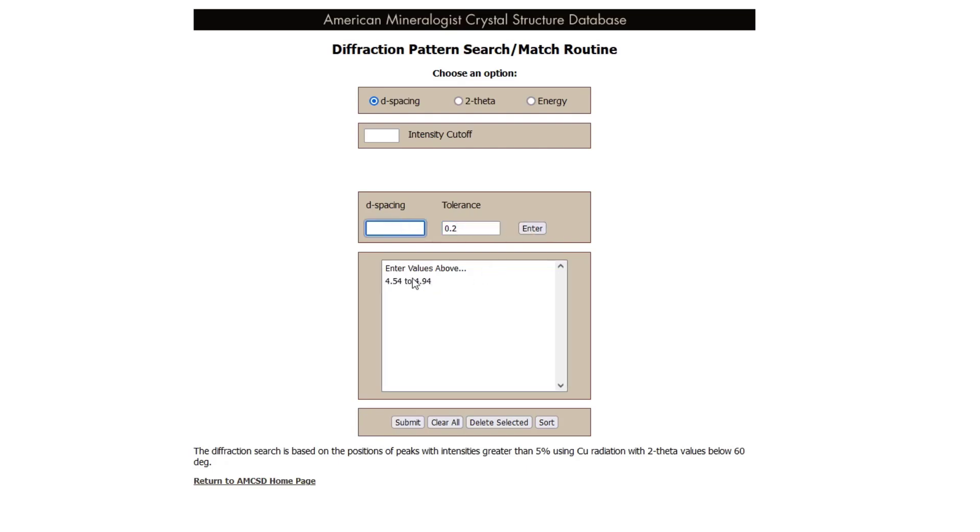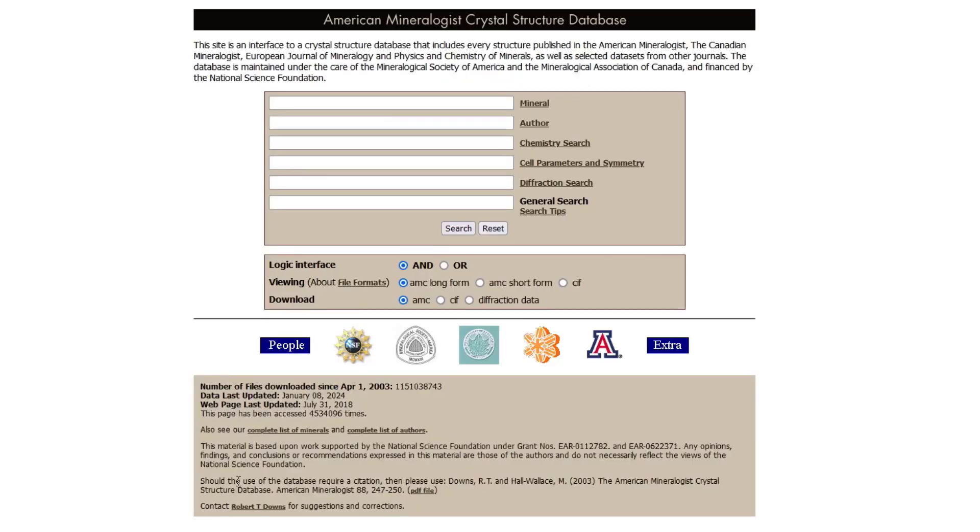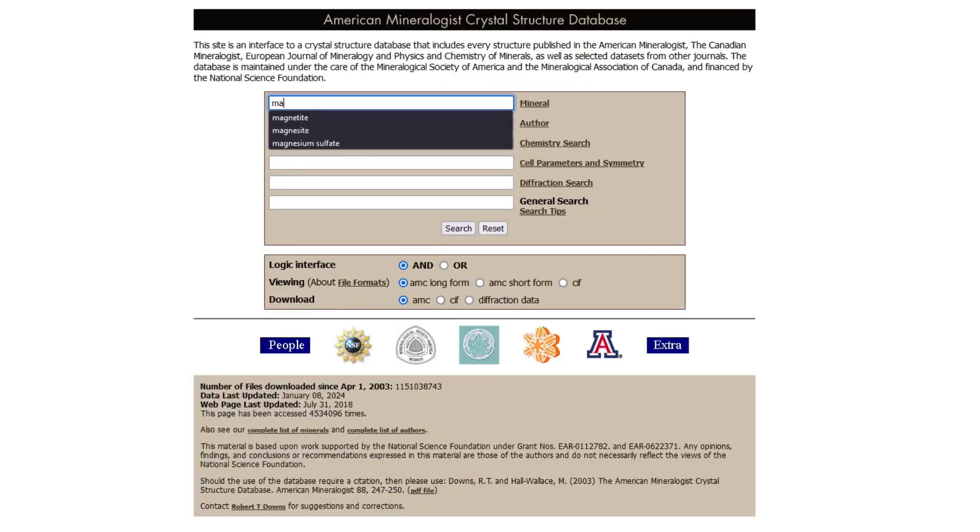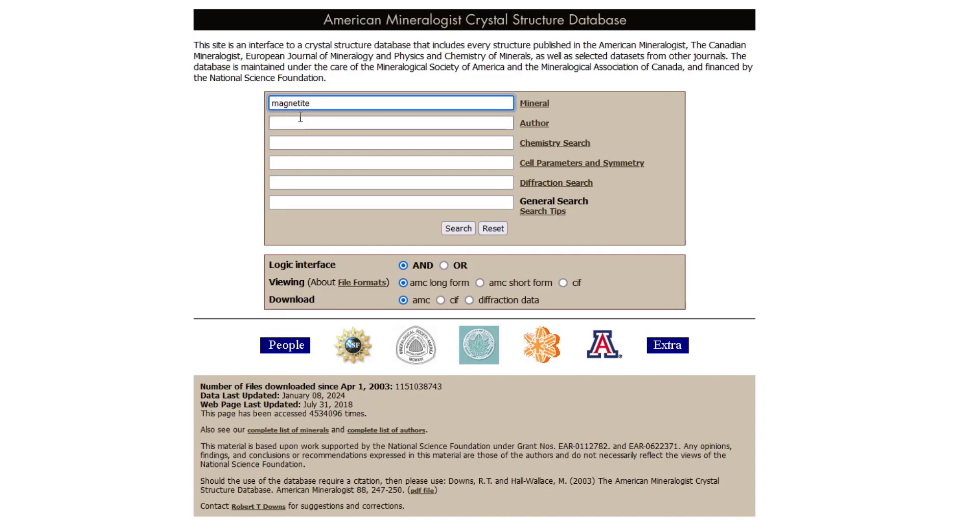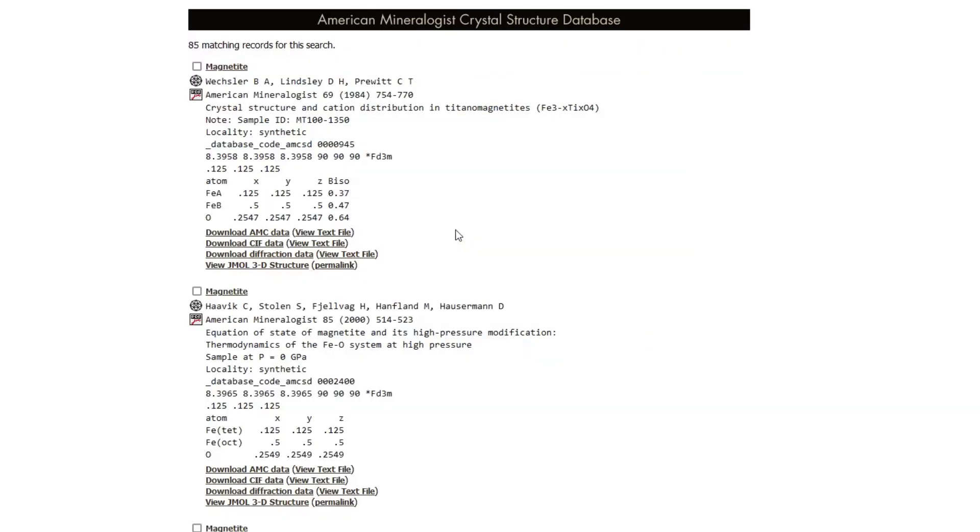But what I typically use is actually just the mineral name. That's the first box. We just type in the mineral name because I usually kind of know what the possibilities are. I'm typing in magnetite here. Our structure is not magnetite, but it's the same process. This gives us five matching records or 85 matching records. That's a lot to go through.